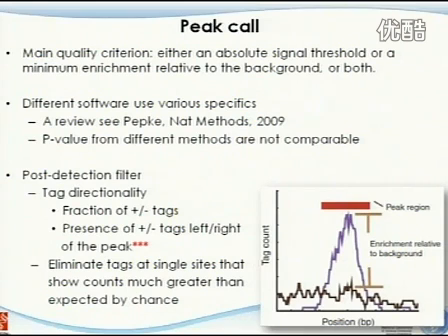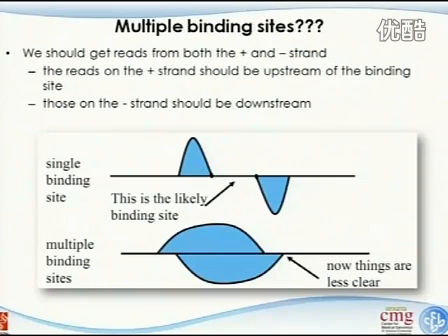In our first ChIP-seq experiment, we saw in one of the samples, I think, over 50% of the reads in one genomic location. The reason for that, people later figured out, is that the PCR steps really mess things up, they aggregate things, and eventually generate those artifacts. So if you see something weird in one genomic location, don't focus on that. That most likely is junk.